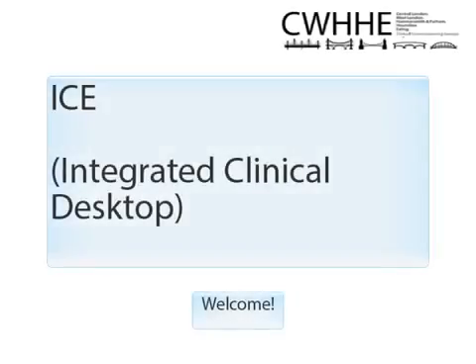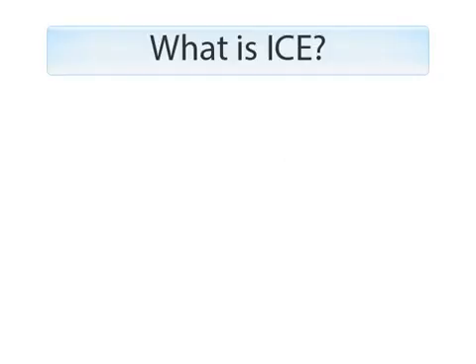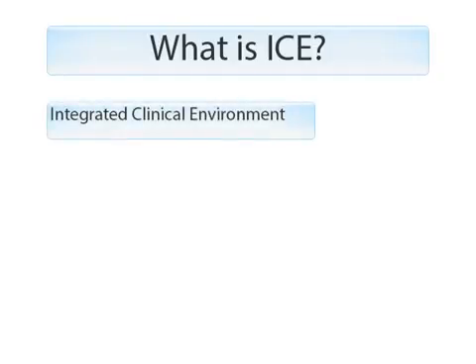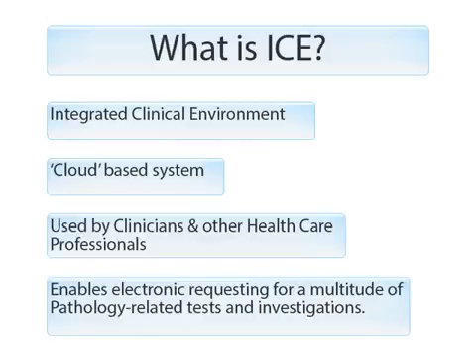Welcome to the Pathology and Radiology Test Requesting System, commonly known as ICE. ICE is the shortened term for an integrated clinical environment. ICE is what we call a cloud-based system and is currently used by clinicians and other healthcare professionals to electronically request a multitude of pathology-related tests and investigations.